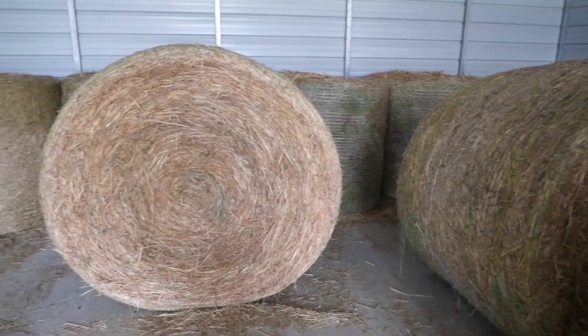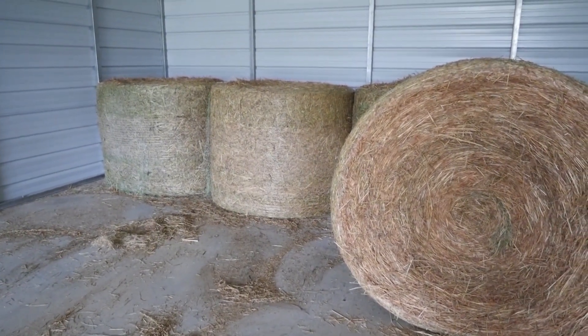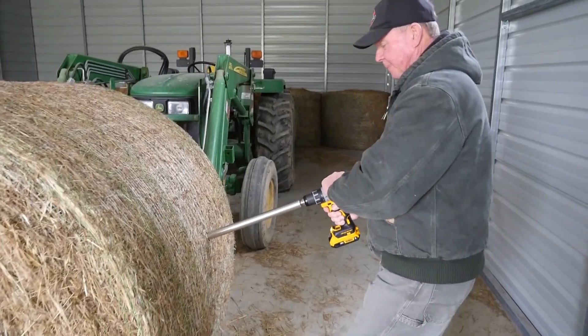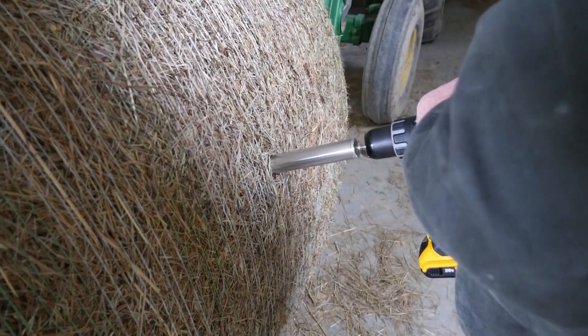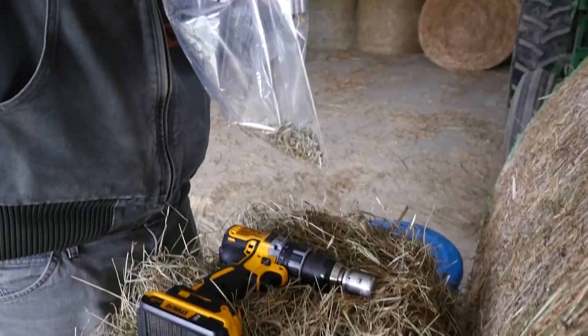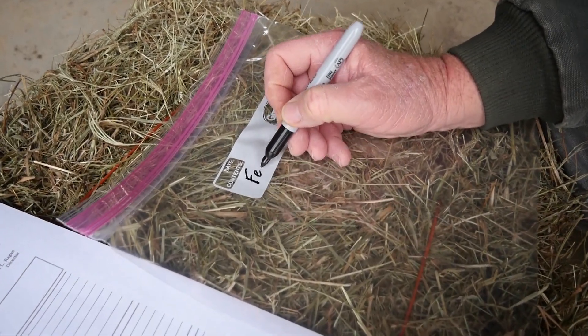If you want to test round bales of hay, you're going to want to sample from the round side of the bale so that you go through the different layers of the bale. Make sure you're taking multiple samples so it represents the entire lot of hay. Once you do that, you'll fill a gallon-size Ziploc bag, make sure it's properly labeled and matches your form, and you're good to go on sampling round bales.